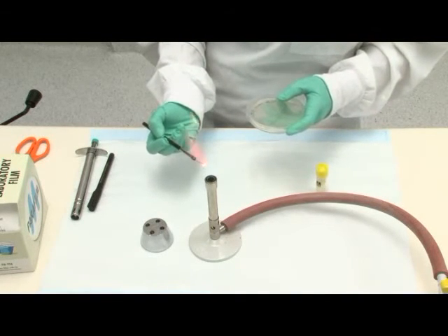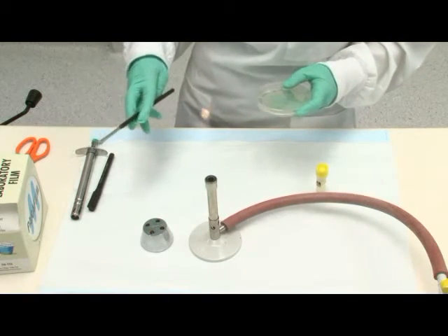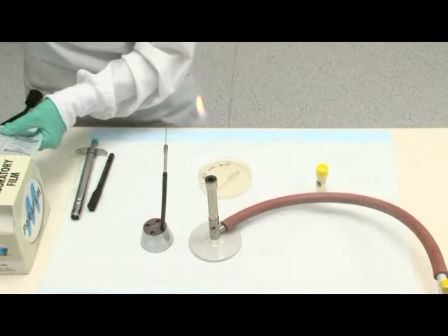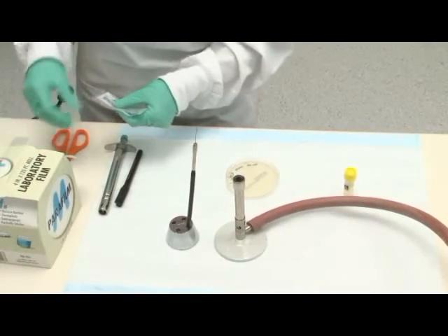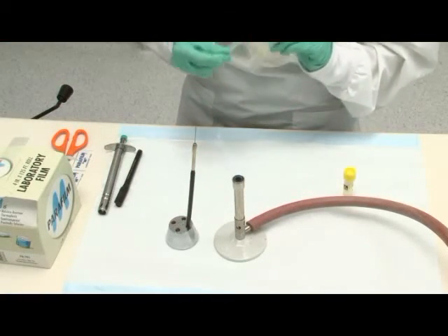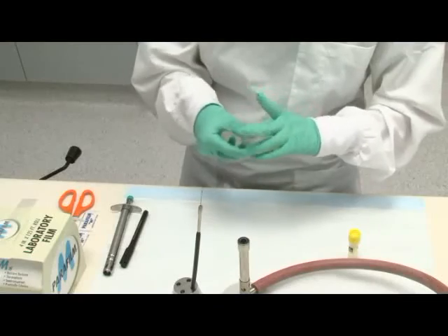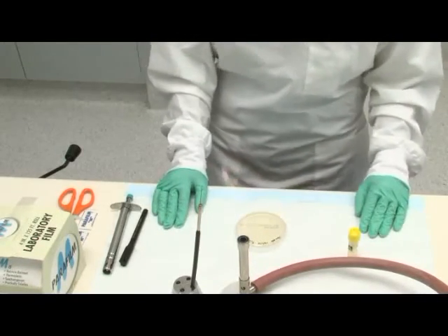Place the lid over the agar plate and seal it with parafilm. Invert and incubate the plate at a suitable temperature.